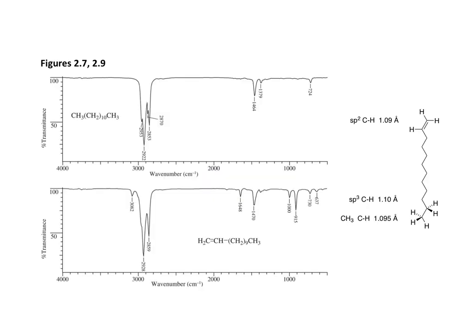The remaining slides show infrared spectra, primarily from the textbook, which will exemplify various structural features.